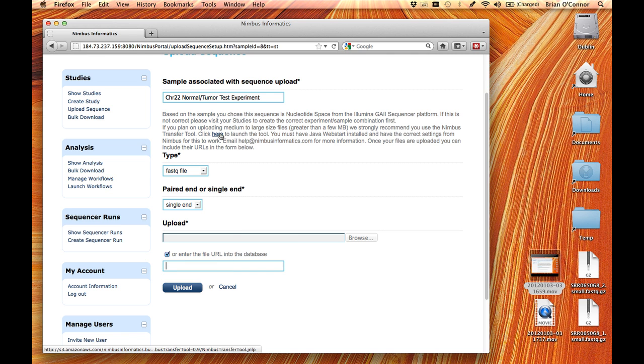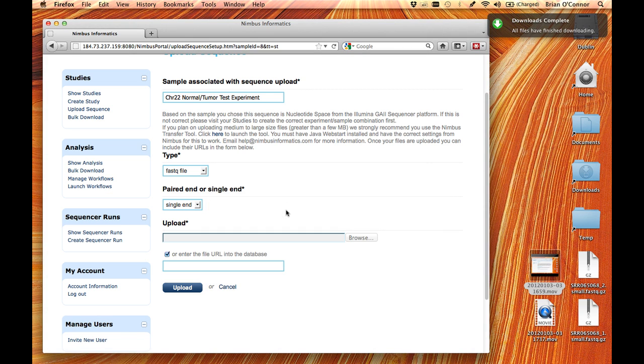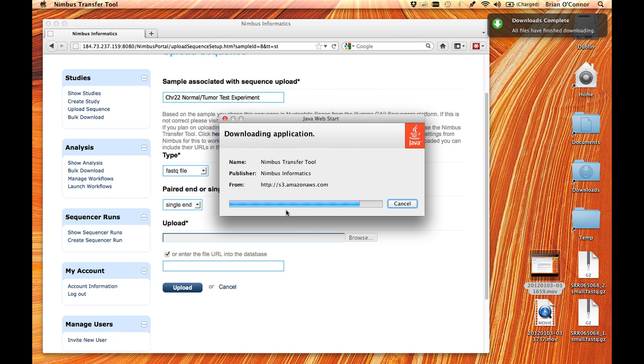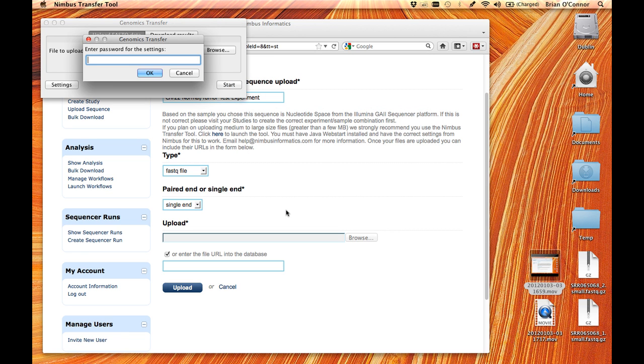Okay, so I'm going to start by clicking on this link, and this is going to run our upload tool that's written in Java. Just make sure you have the latest version of Java installed and you have Java Web Start configured in your browser, and it should work fine.